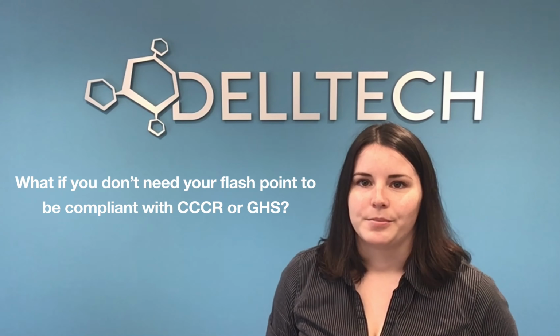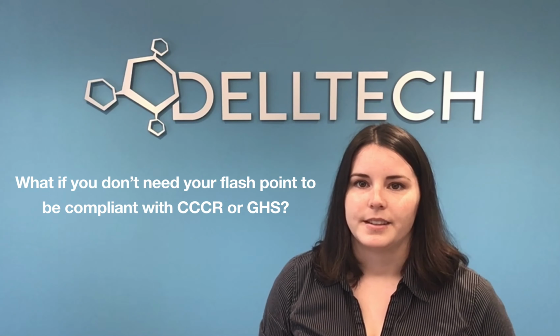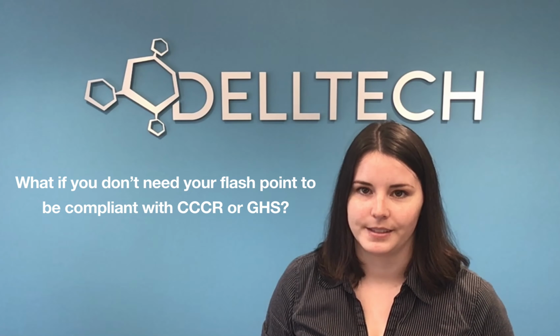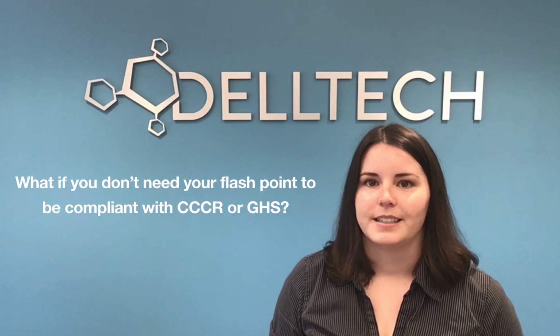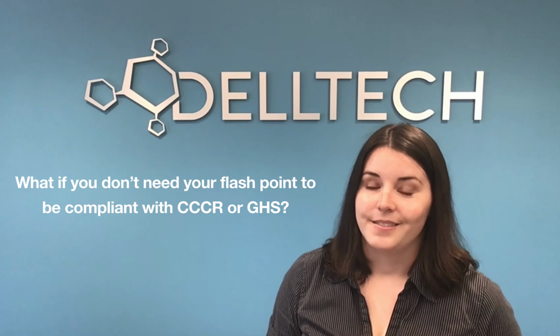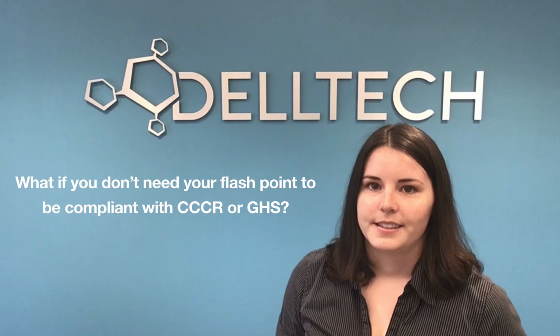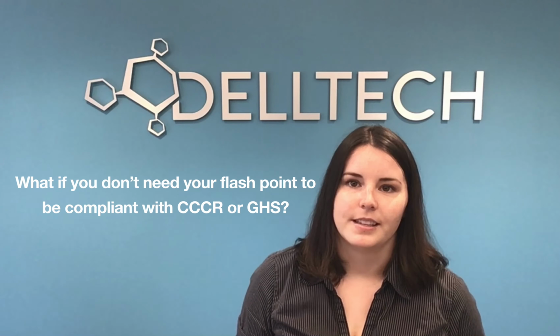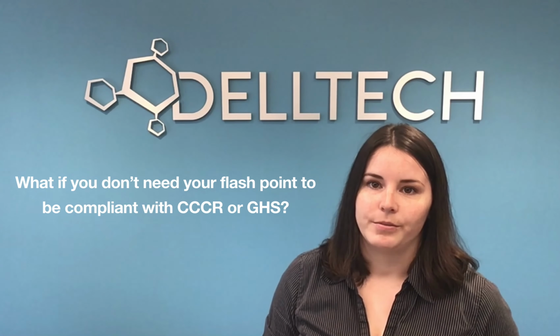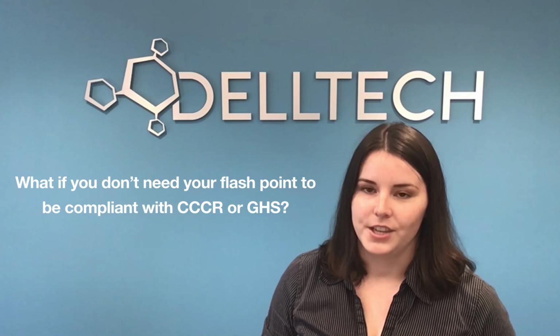What if you don't need your flashpoint data to be compliant with CCCR or GHS? Sometimes a company may wish to test a flashpoint of their product purely for quality control comparison testing. Perhaps they had their product tested with a particular method in the past and would like to use that method again, even if it is not compliant with CCCR or GHS. In this case, it is fine for the company to request the non-compliant method for such a purpose, but the results may not be applicable for the product intended for Canadian consumers, CCCR, or workplace, GHS.